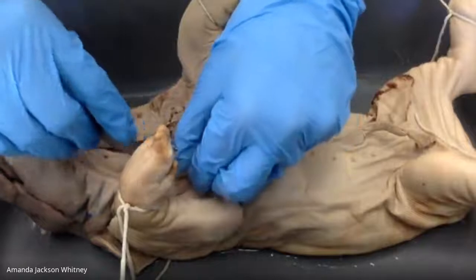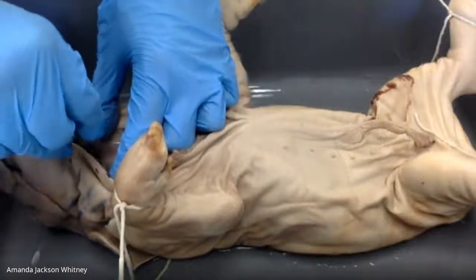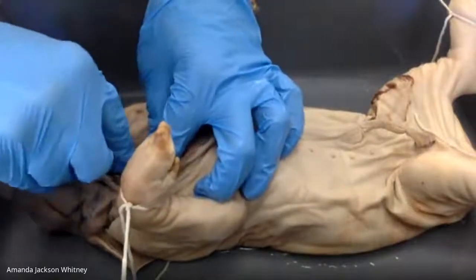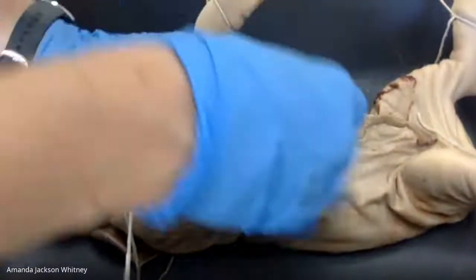It's so cool how all of that nutrient can go through that small of a tube. It is cool. Yeah, the tubes are very small. Are they that small? They're bigger in people, but they're very proportional, if that makes sense. We're talking about how the intestines are not that big around.